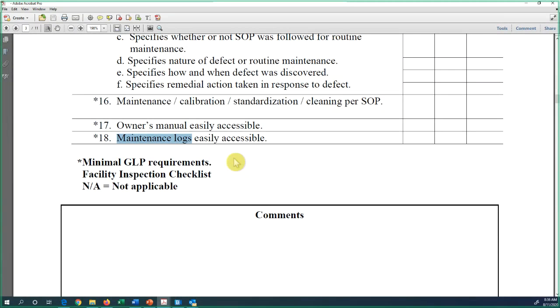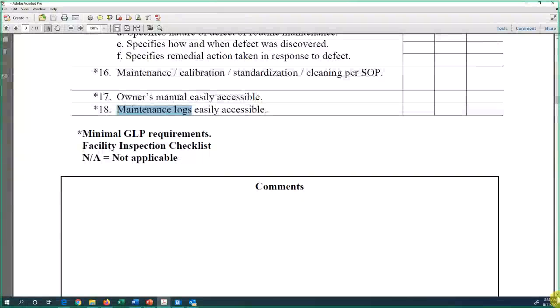You say, today I ran 50 injections. Tomorrow I do maintenance on the column. Then the day after tomorrow I do more analysis. Then later I change the septum. That's very difficult to follow one by one. So it's better to have maintenance on the side in at least one session, then you put all the activities on the instrument in the use log. So it should be 2 sessions or 2 books, 2 logs for each instrument.